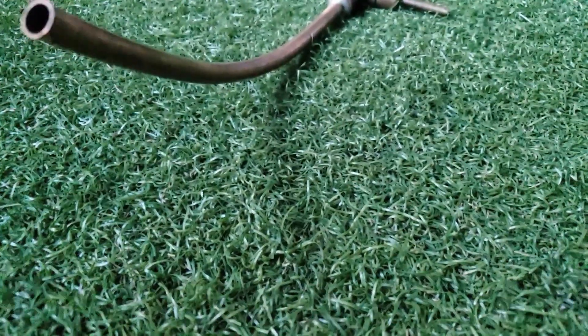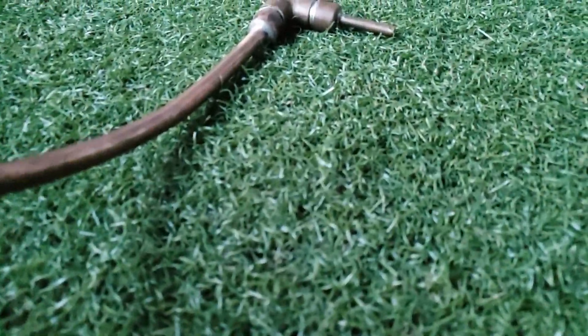When everything was said and done, I gave it a good cleaning with — big surprise — a pipe cleaner, and got it nice and shiny and clean. I threw a compression fitting on it and here we go. Bam! The fully completed Liebig condenser.